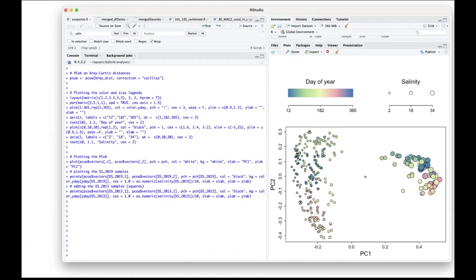Now you might wonder, these data sets had quite a bit of overlap in the ASVs, and this is because exactly the same PCR primers were used for generating this data set. What if we use different PCR primers, so you cannot really compare the ASVs? Well, then I would recommend that you do the analysis at the genus level instead.